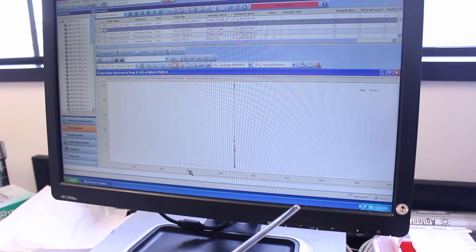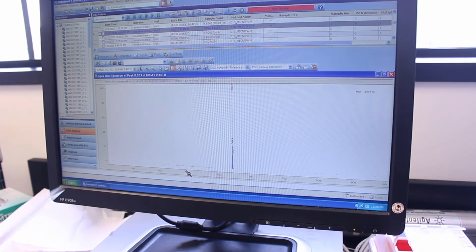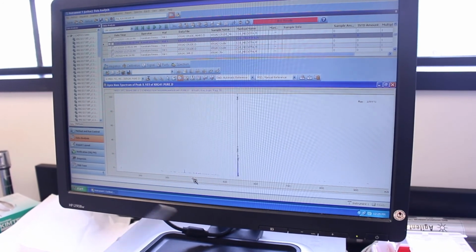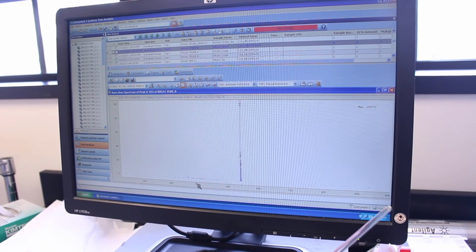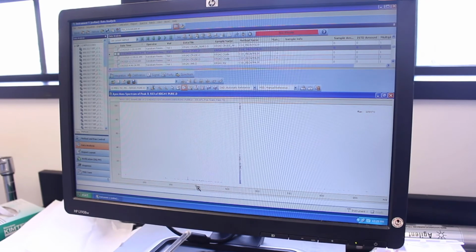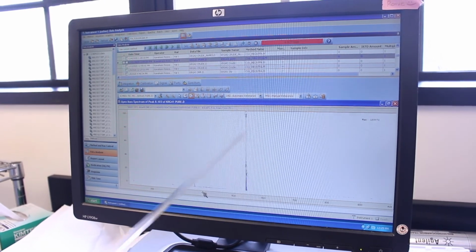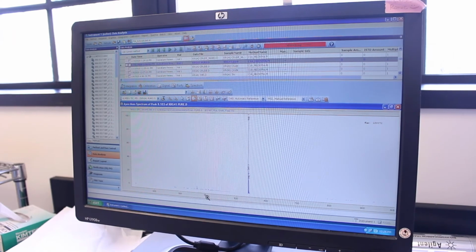So in most cases, most ions, whether it be in GCMS or LCMS, and provided the molecule is small, so in the purpose of organic chemistry lab, the molecules are small, z is usually equal to 1. So it's not a big number. If z is equal to 1, then the m, the mass to charge ratio, m is always what it is. So anything divided by 1 is itself. So we don't have to worry about charges dividing the mass in half. So if it says 540.1, the mass it's measuring is 540.1.